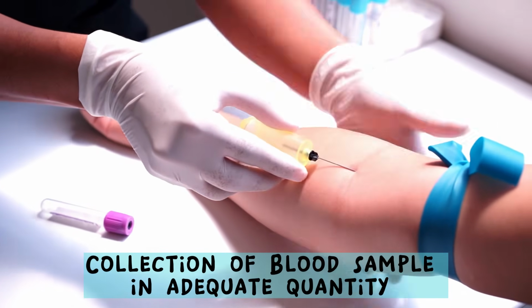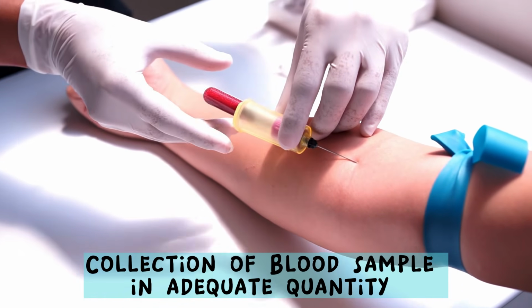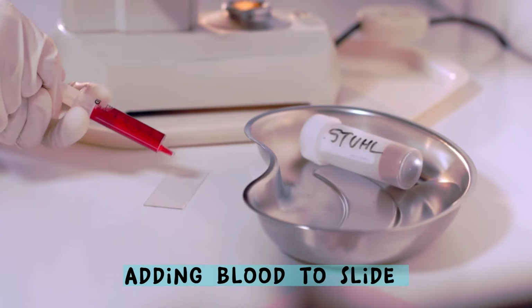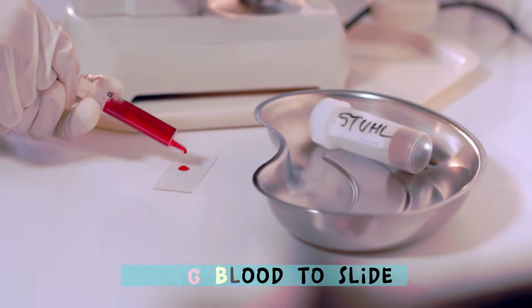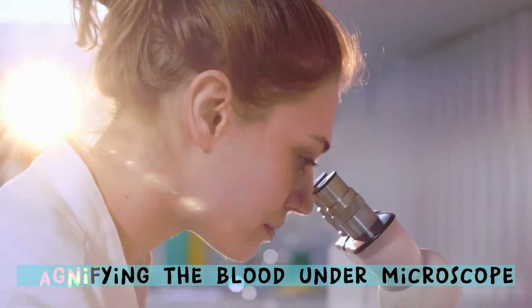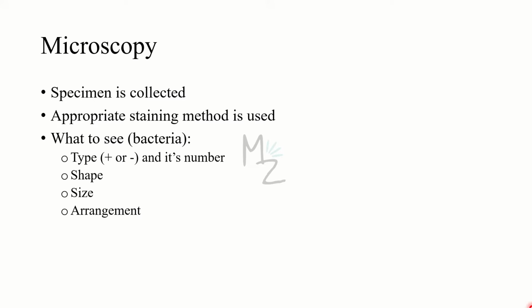The specimen is collected. After the collection of the specimen, stain the specimen using the appropriate procedure, for example, gram stain or acid-fast stain. If bacteria are seen in gram stain, then their shape, for example, cocci or rod, size, arrangement, for example, chains or cluster, and whether they are gram positive or negative or acid-fast are observed. And it is also important to know the number, either one type of bacteria or more than one type involved.